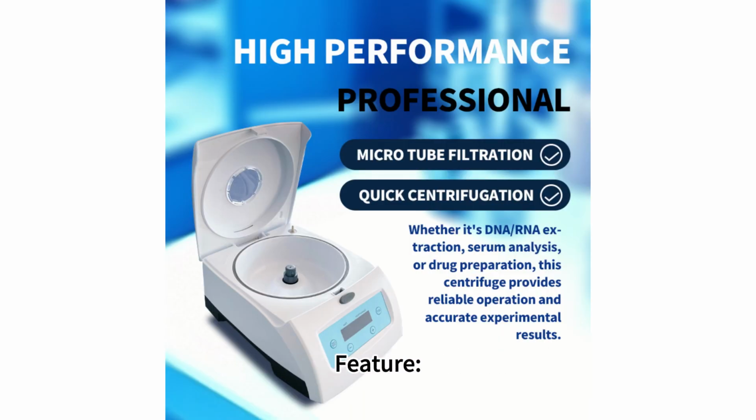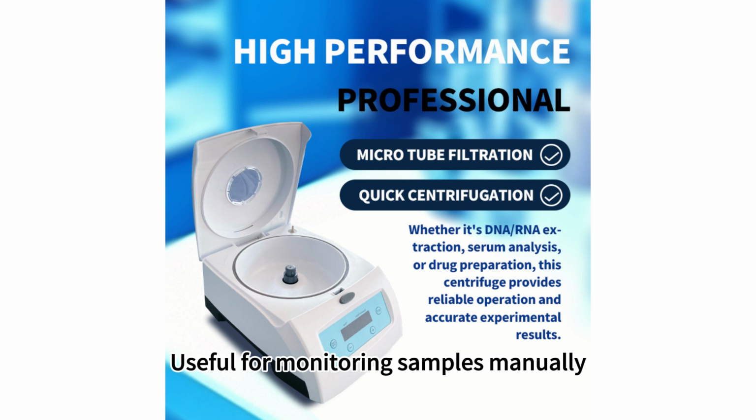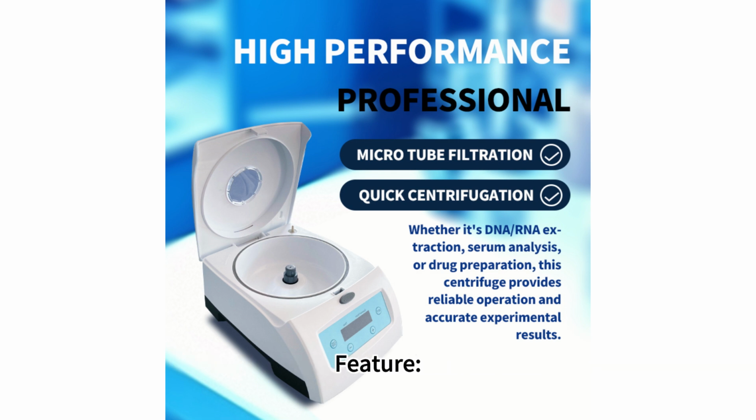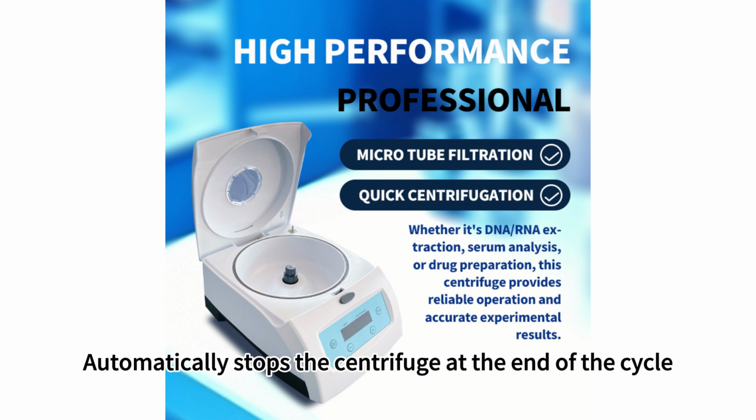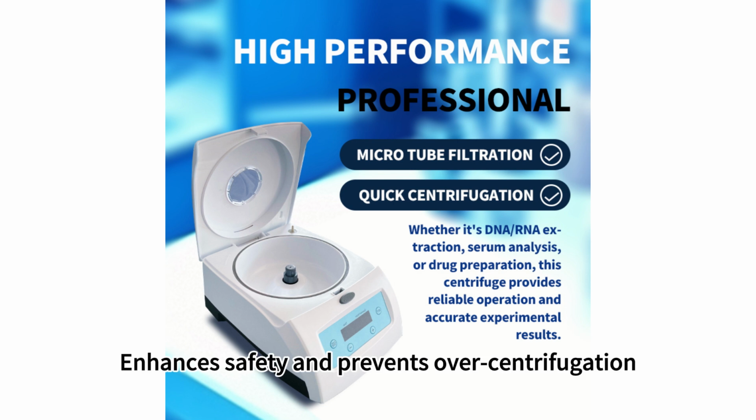Continuous run mode feature. This is an option for continuous operation without a set time. Importance: it is useful for monitoring samples manually. Auto shutoff feature. It automatically stops the centrifuge at the end of the cycle. Importance: it enhances safety and prevents over-centrifugation.